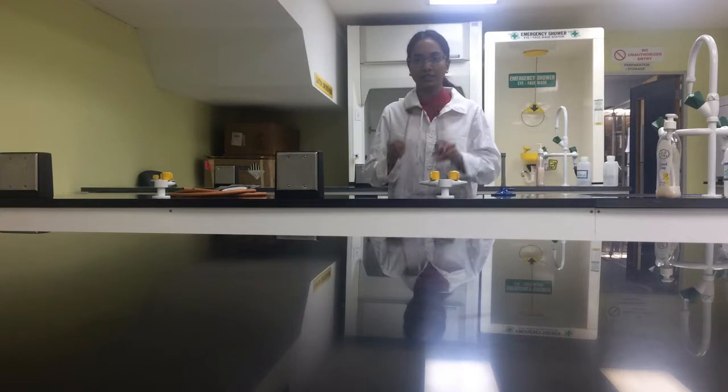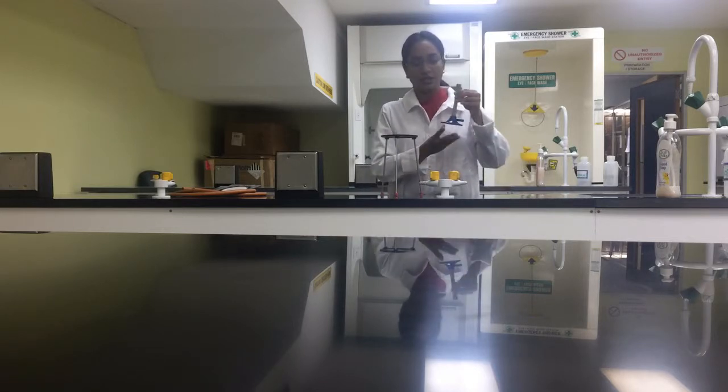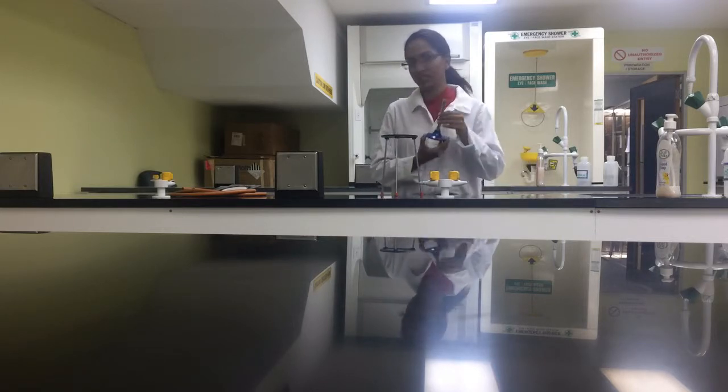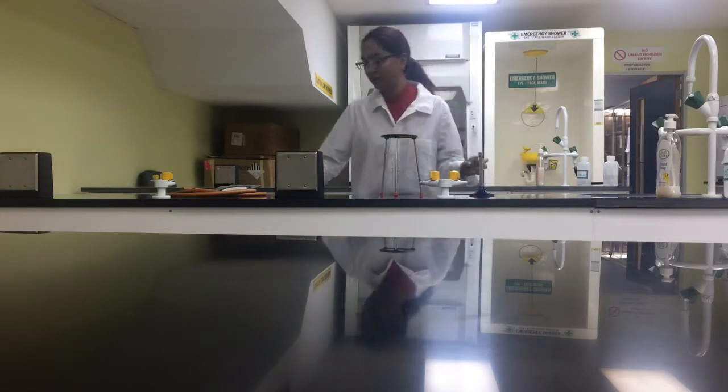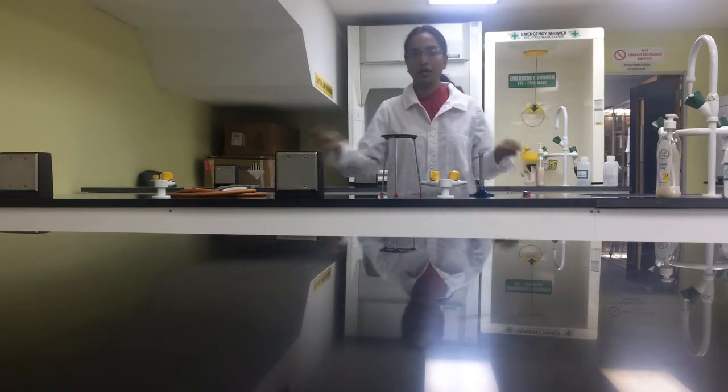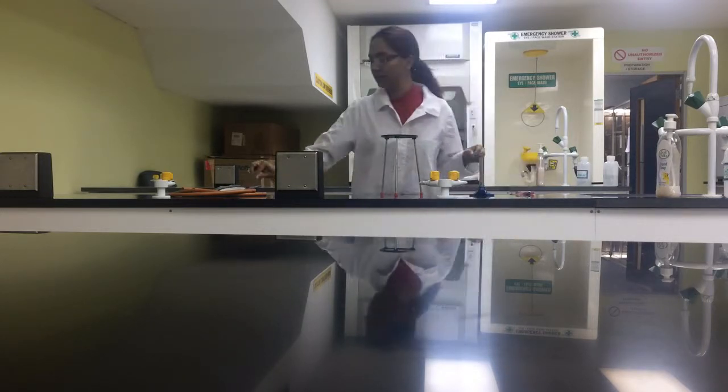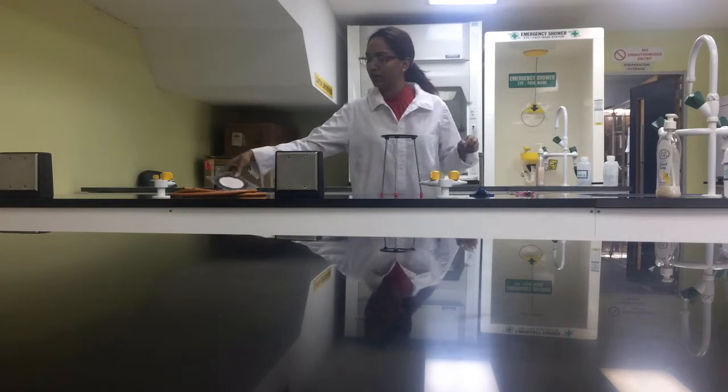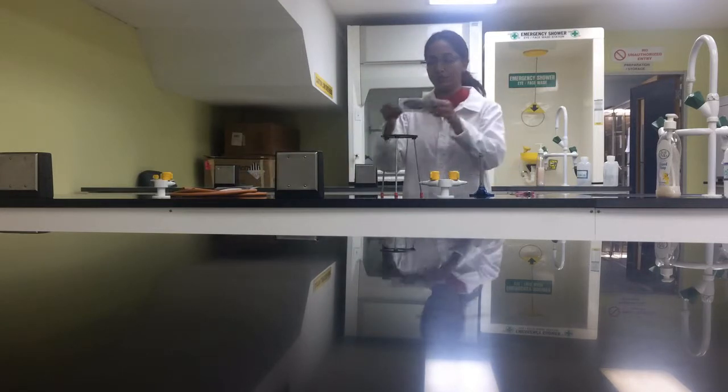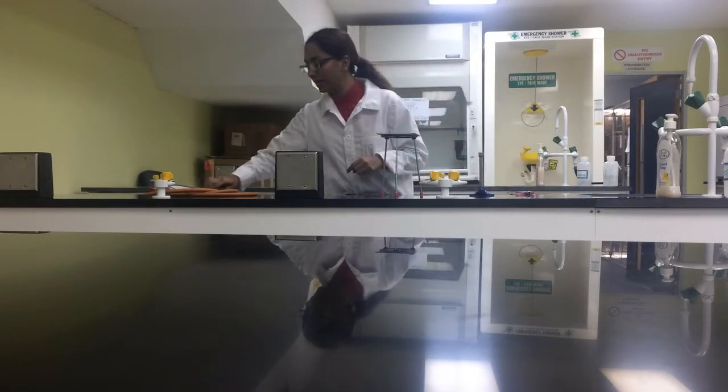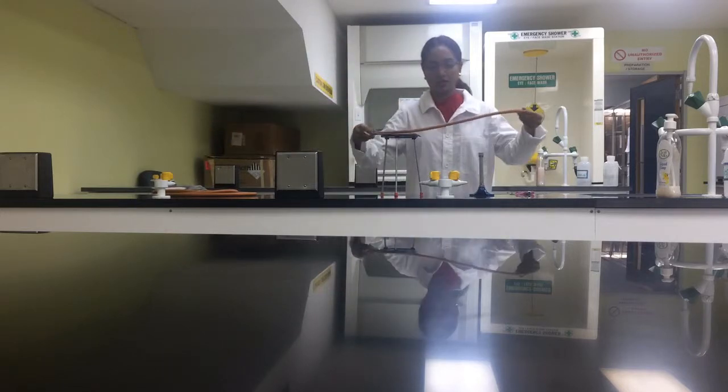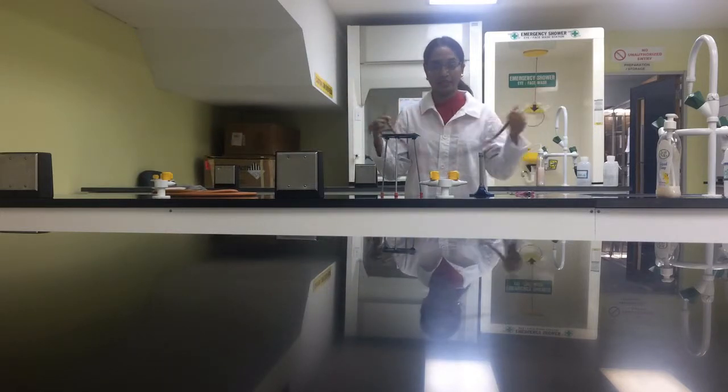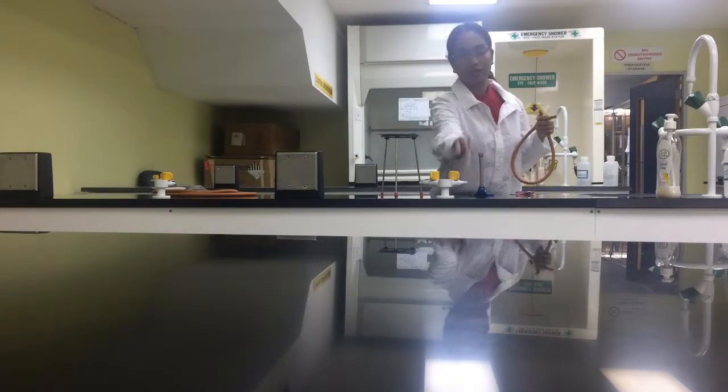I have a tripod stand of course, the Bunsen burner, a little striker, a lighter, a wooden splint, a wire gauze which I'm going to place on top, and a hose to connect the gas. This is the gas tap here.